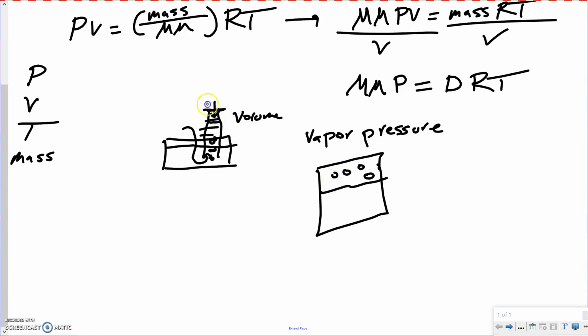So keep in mind, you're not just collecting one gas. The volume of gas that you created in here is actually for 2 different gases. But keep in mind, even if you collected 5 liters, it would be 5 liters of the lighter fluid, which we'll just call LF, and it would also be 5 liters of the water vapor, because both gases are taking up the full area in which you are collecting gas. So that really doesn't affect our volume measurement, but it does affect our pressure measurement. So let's talk about pressure.